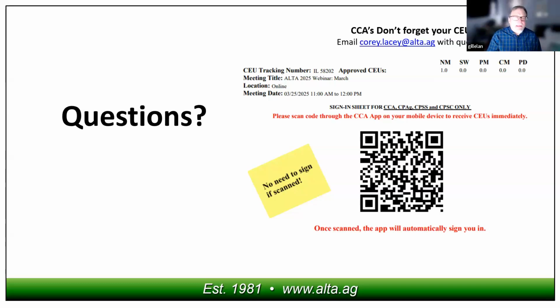I come back to ionization, I think, and also what elements are they seeing that are affected negatively? Obviously, if you get a 150% internal standard recovery, then everything attached to that gets negatively affected. But I will say that elements with higher ionization energies in high matrix samples do better with a high ionization internal standard, like tellurium or germanium. So those elements will behave more like those high ionization energy elements like phosphorus, boron, things like that.